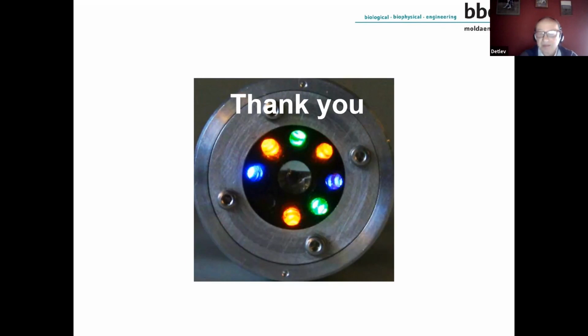The advantage of this instrument is that you can get the information about the presence of the cyanobacteria in a very early stage. The determination of the biotoxins takes a longer time, and you have to bring these samples really to the laboratory and perform a sophisticated analysis. So usually they do this measurement of separation on columns, and afterwards mass spectroscopy to identify the biotoxin, and this takes a long time. So therefore, the advantage lies in the rapid detection of the cyanobacteria.